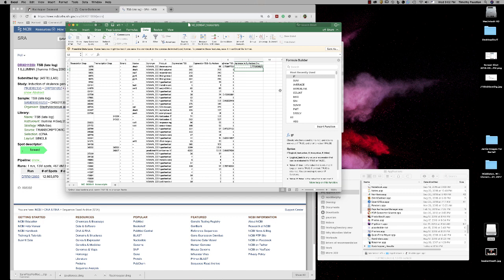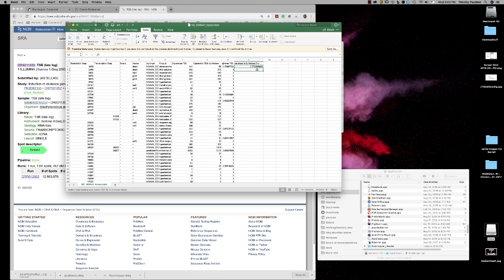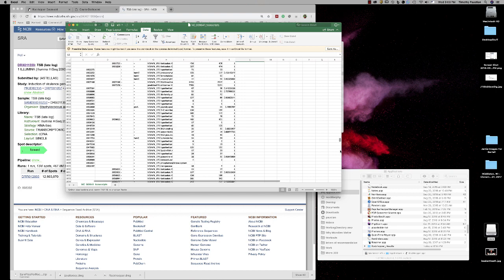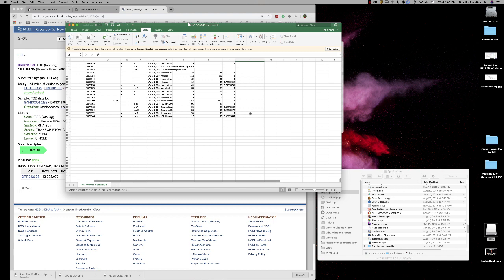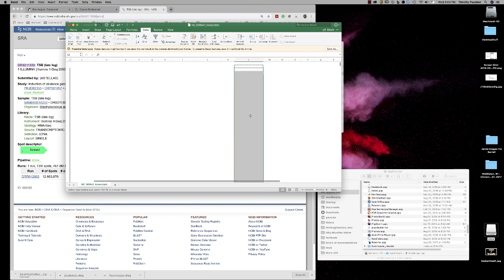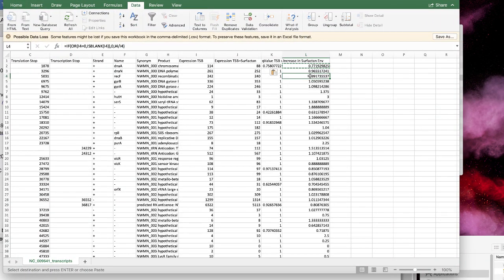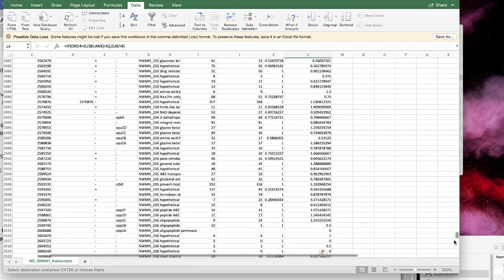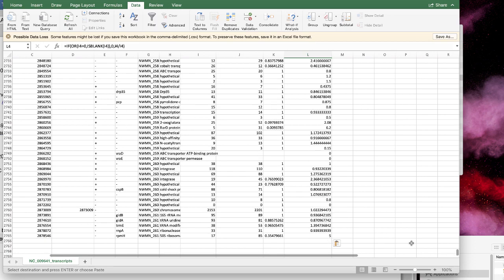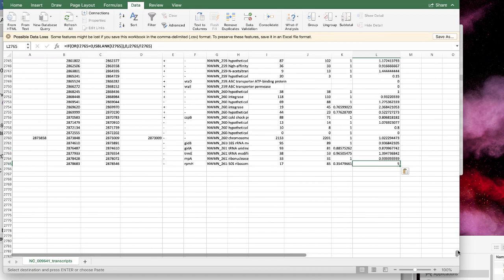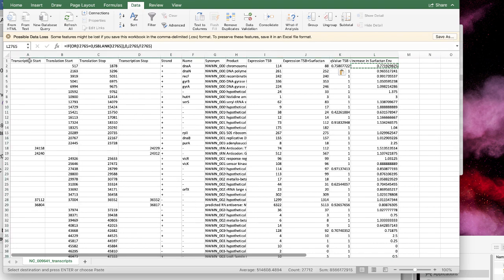Now we're going to copy that formula, select it, then scroll all the way down to the bottom of your genes. Hold down the Shift key, click, and then paste those values in. Now we've put in a value for every one and we're going to see which ones increase and which ones decrease.